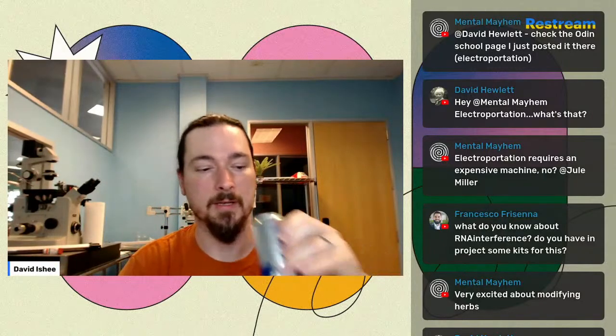There's a similar thing that happens, and it'll create a hole in the cell membrane that's temporary. And during that time, if you have a bunch of DNA on the outside, it makes a hole and DNA can just go in. Then you just turn off the voltage and it closes up and it's gone. So it's usually just a quick zap and DNA is inside. So electroporation is a pretty common method for genetic modification.